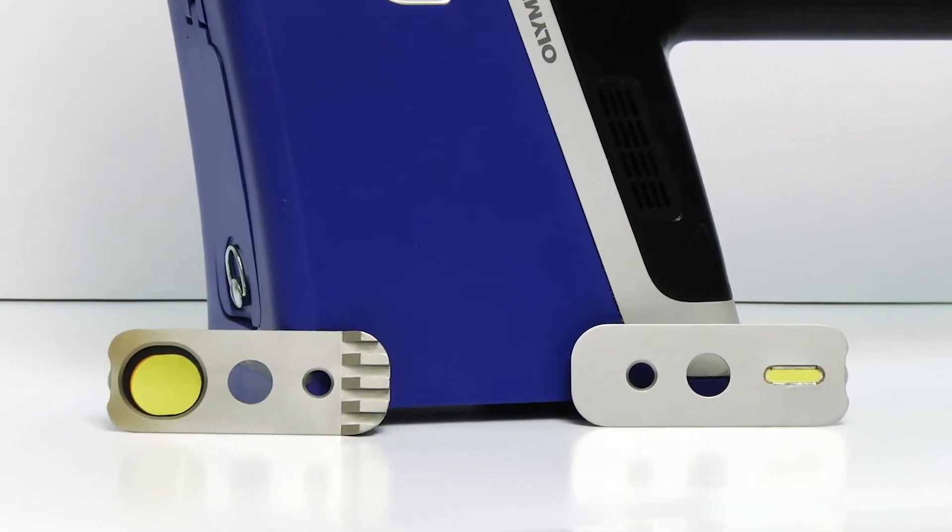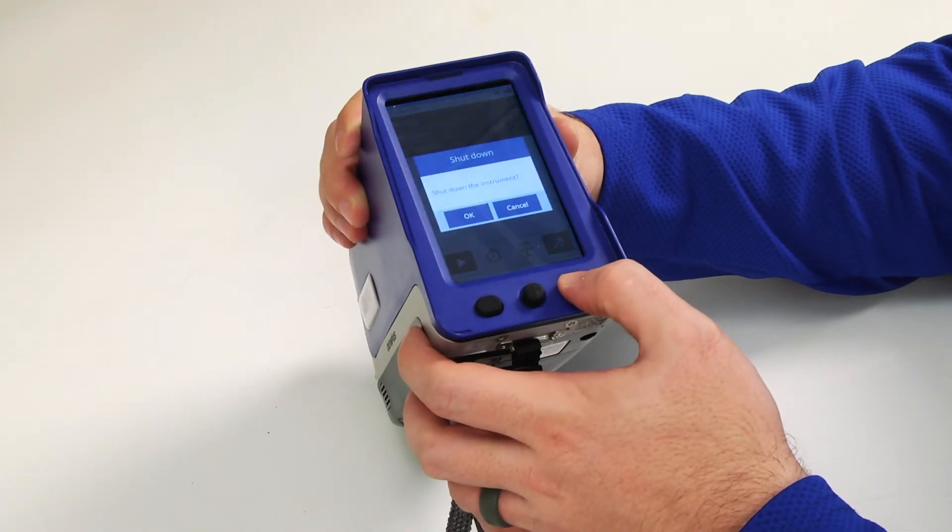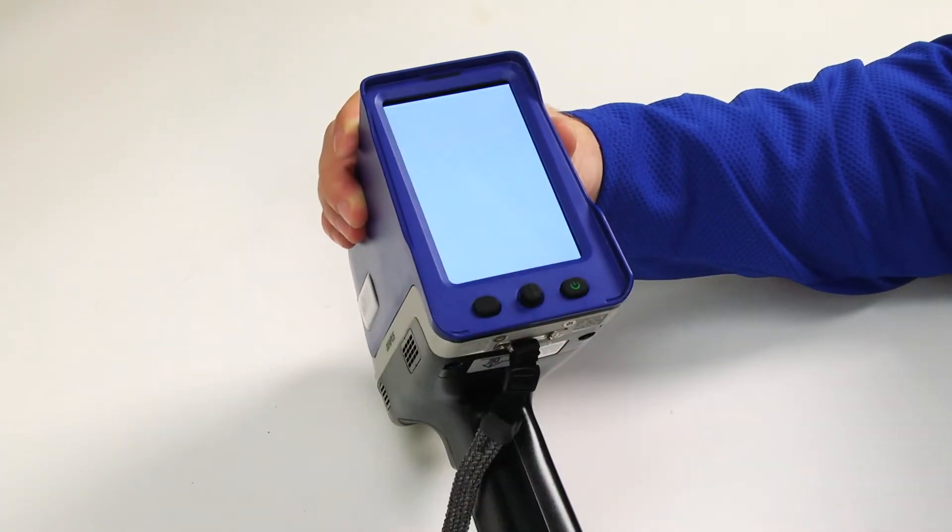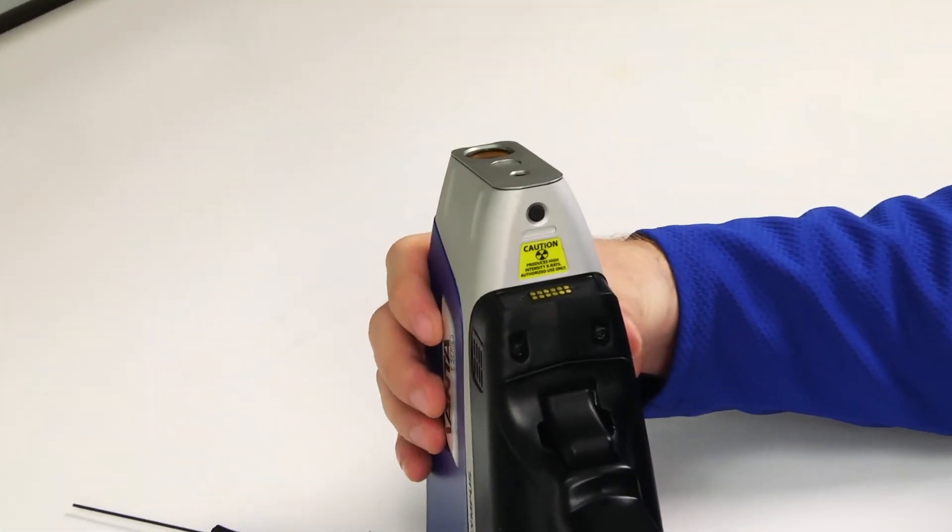I'm only going to demonstrate using the hot heel, but the process is the same for the weld mask. Start by making sure that your Vanta is powered down and remove the Vanta faceplate by pressing the large round button on the underside of the probe head.